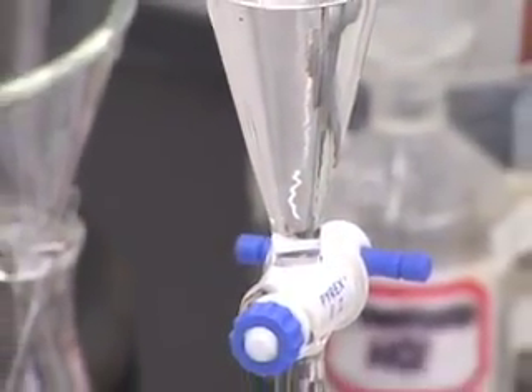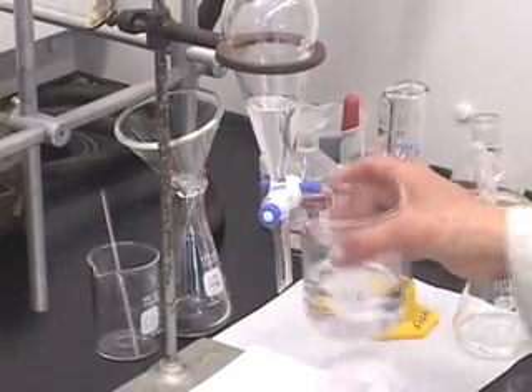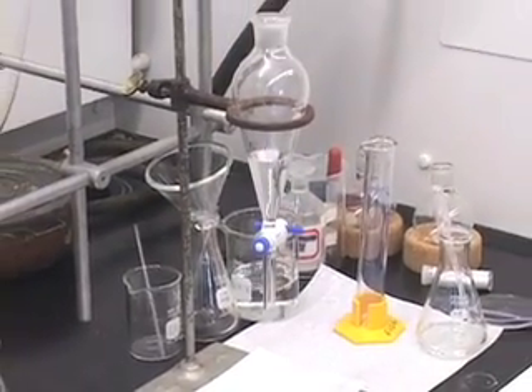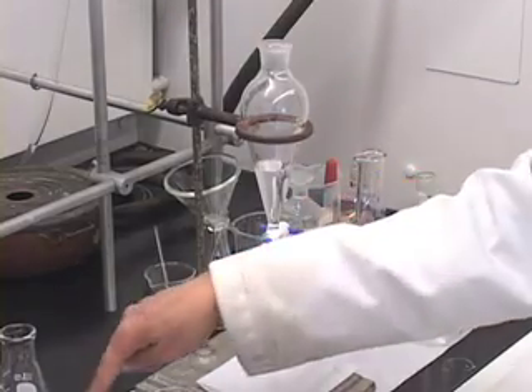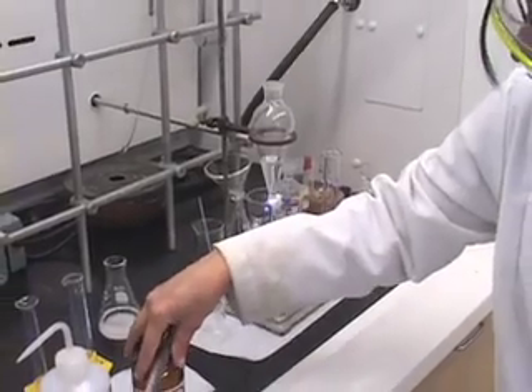The first step of the drying is done. What we want to do is drain this into a dry Erlenmeyer flask where we are going to dry it over the sodium sulfate salt, as we did before.